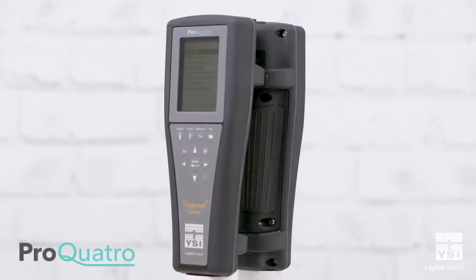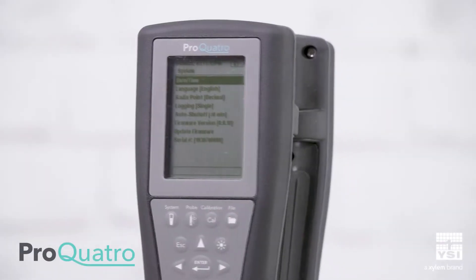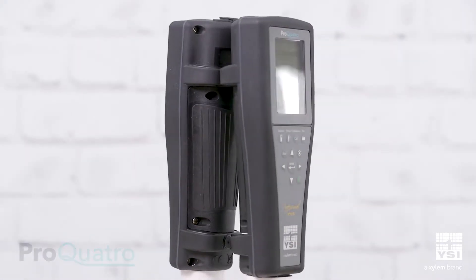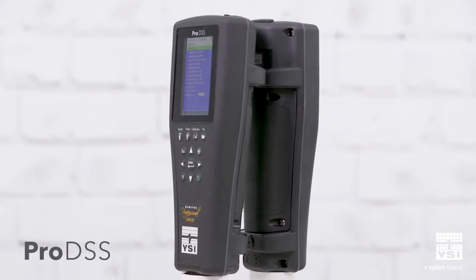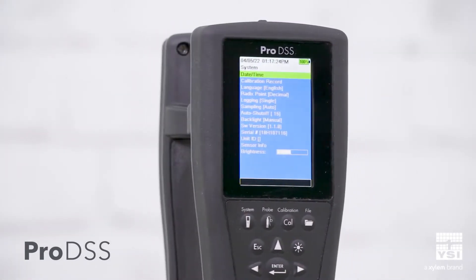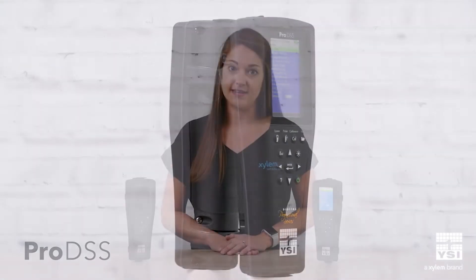These multi-parameter instruments provide high-quality data in a variety of applications, from rivers and streams to groundwater, aquaculture, and anywhere else your monitoring takes you. Smart features, including a built-in USB port and an intuitive user interface, make data collection easy and convenient.